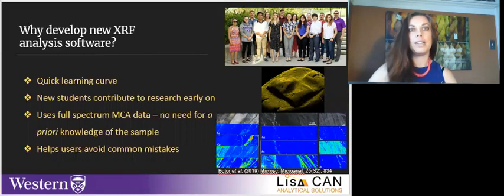Since 2017, over 24 students in our research group have analyzed synchrotron micro-XRF data. The students in the top picture were part of a 12-week summer undergraduate research program. They were all able to learn Peakaboo and analyze micro-XRF data from multiple synchrotrons in mineral exploration projects, environmental studies, and archaeometry. Here are 2 examples.